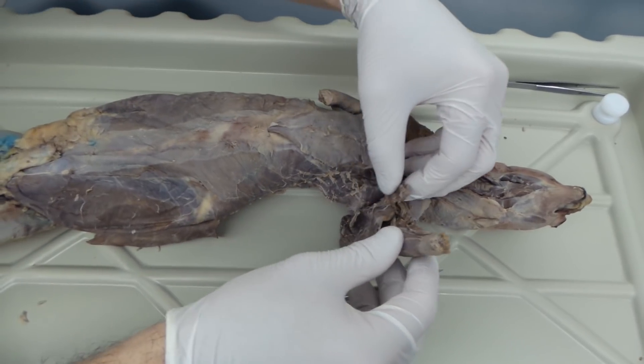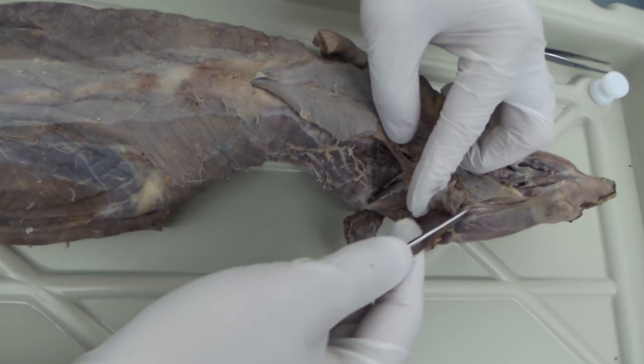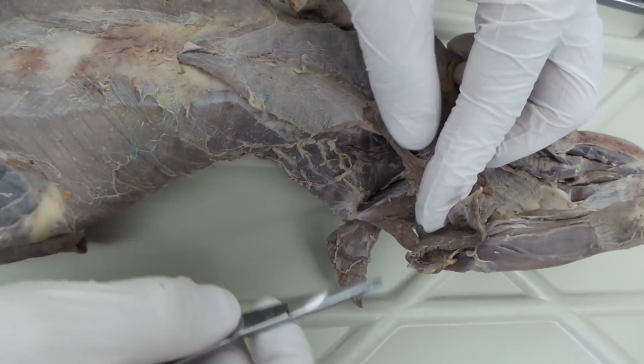When you're doing that incision, that cut, make sure you don't cut through the vasculature that's down here. You can see some of these arteries, veins, and some other stuff. So cut up to that.